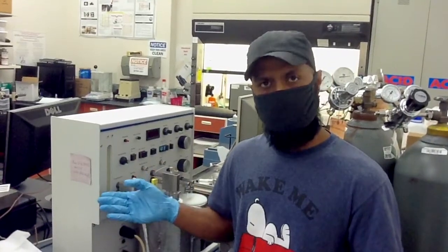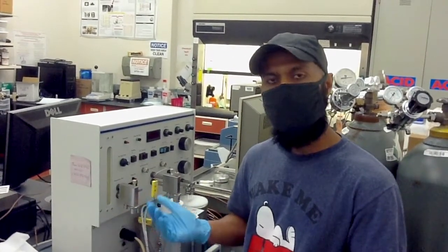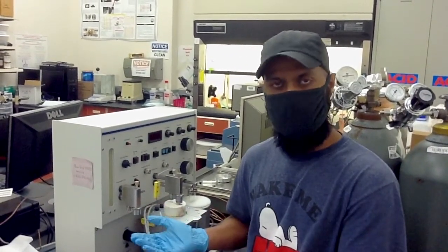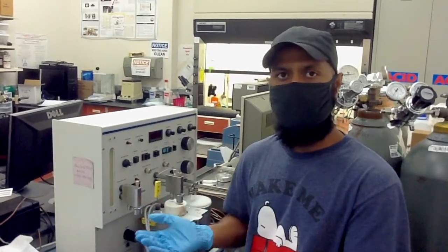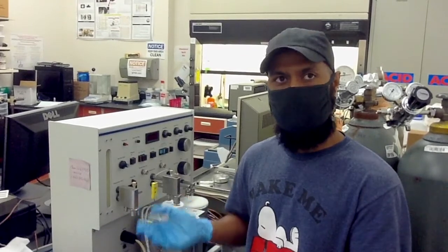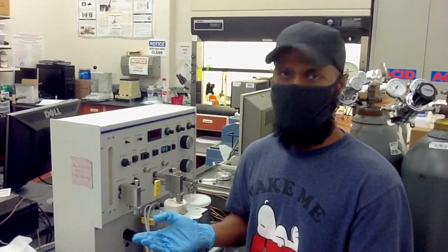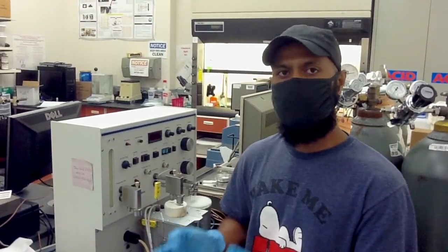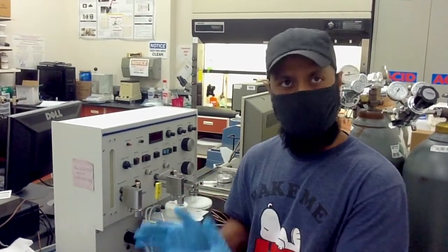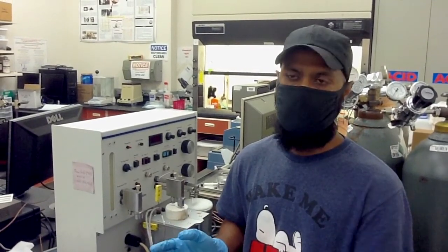If you struggle with the instrument, how to use it, and you cannot get your sample done, try to communicate with Dr. Yasek here, or anyone who can operate this one perfectly. You can seek help from them. If you cannot do your experiment by the time you booked, you can cancel that booking time once again and communicate with the authorities that you cannot do your experiment at that time.